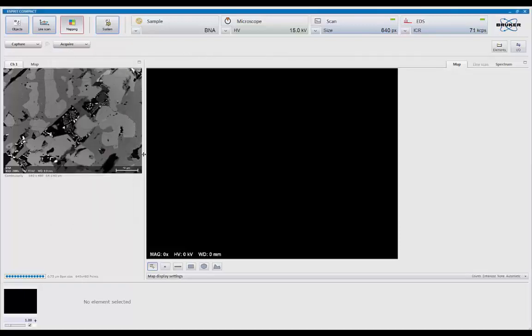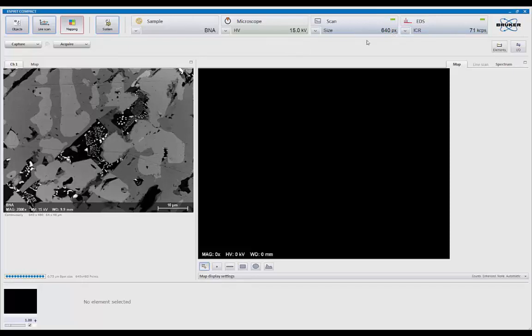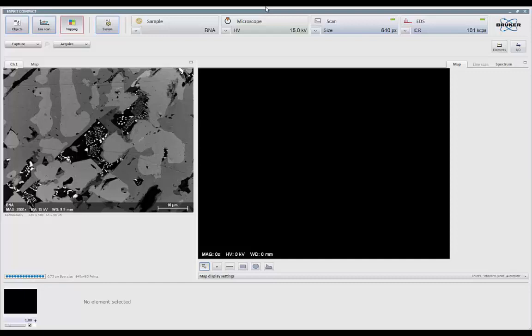So with that, we're keeping it the same. This is 640 by 480 pixel map. I'm going to up my count rate a little bit. Might as well take advantage of the ability of this detector. So I'm going to get it up to about, that looks good, 163,000 counts a second.